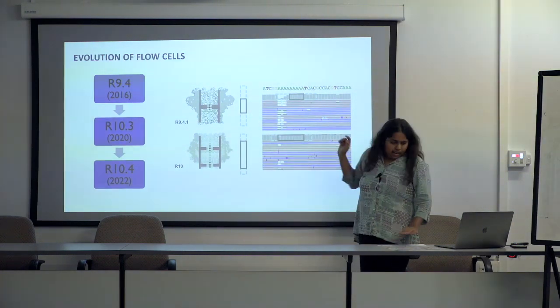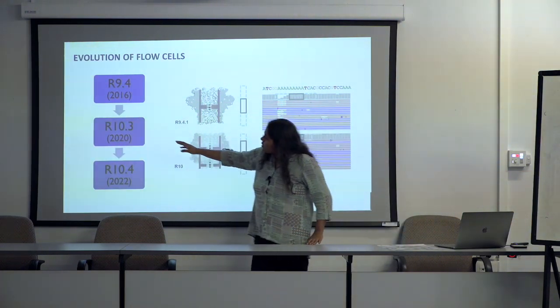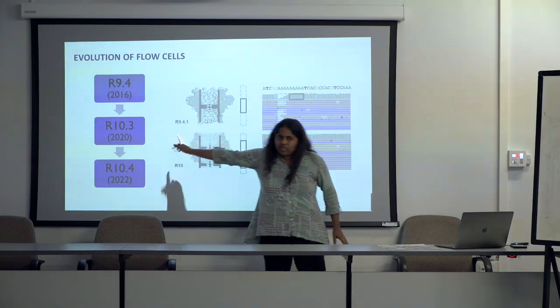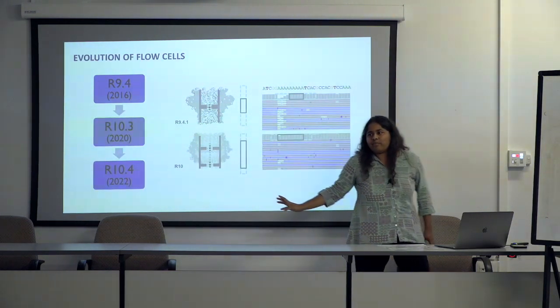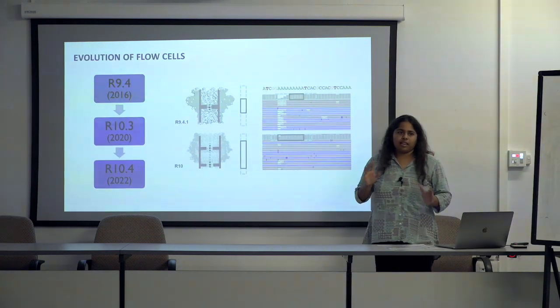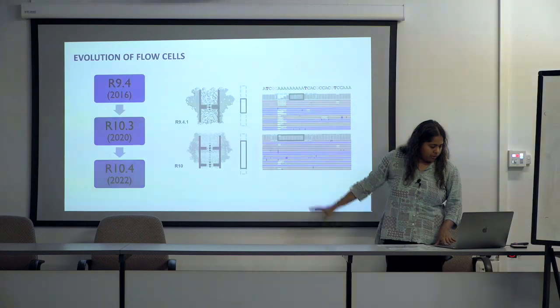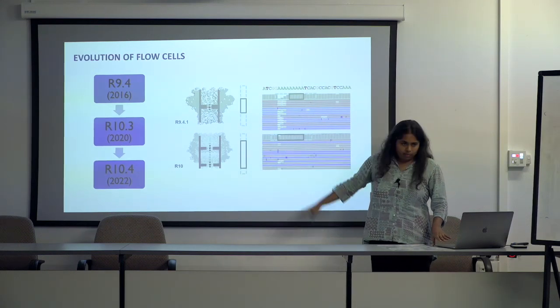The other thing that has been changing quite a bit, I mean, one note is that the exact details of this change are not very clear. I've been trying to figure it out, not sure, but one of the things that they do mention is that the enzymatic aspects of the chemistry have changed in the R10.4. But this has been the most dramatic improvement we have seen.